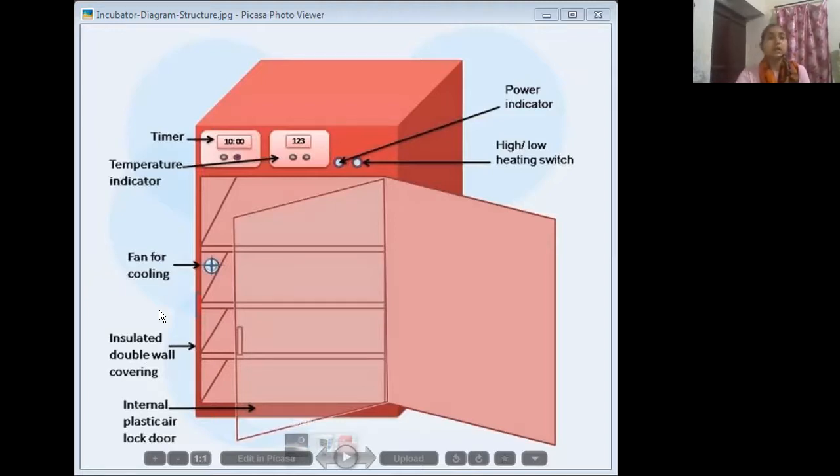Perforated shelves: bound to the inner wall are some perforated shelves onto which the plates with the culture media are placed. The perforations on the shelves allow the movement of hot air throughout the inside of the incubator. In some incubators, the shelves are removable, which allows the shelves to be cleaned properly.